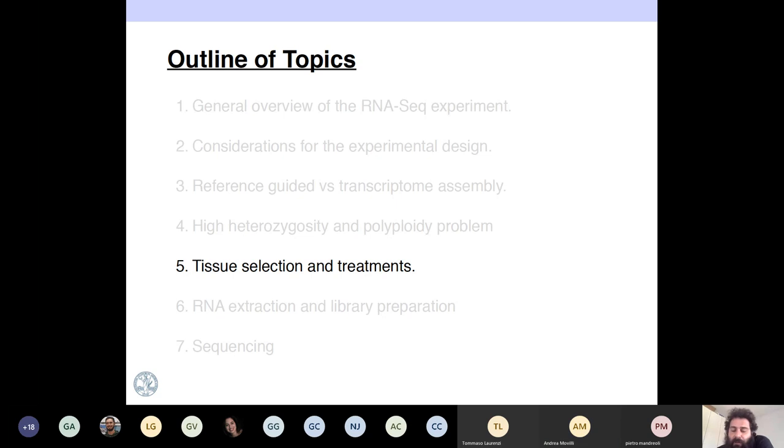So imagine that the two copies that you have problems with have 5 nucleotide changes in 100. That is 5%, which is quite high. But Oxford Nanopore also has 5% errors. So you will have the same amount of errors in your Oxford Nanopore reads as there are differences between the alleles. So at the end, the program doesn't know if it's a problem of the errors.